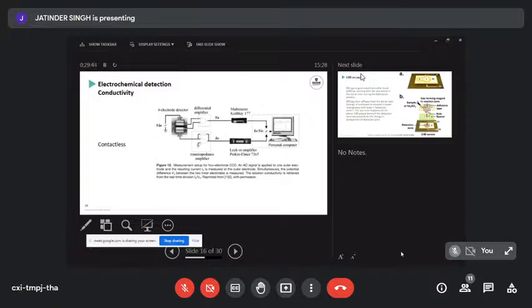The expensive one looked really nice. It had a bluish glow to it. It was a pretty thing to look at, but this one is as effective and a lot cheaper to make, and a lot less waiting around. I would plate electrodes in a batch of 50 or so at a time, and then making devices with laminated photoresist would be 2 hours of work. So on a normal day, I could just make a device, destroy it, and make a new one. Whereas with the other ones, I had to wait 2 weeks.